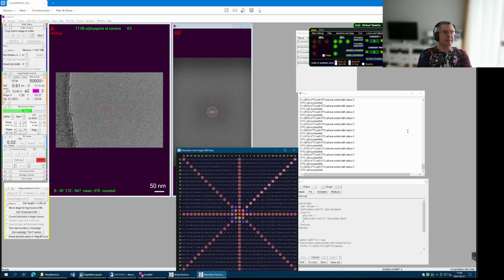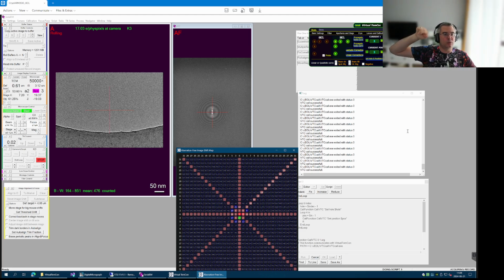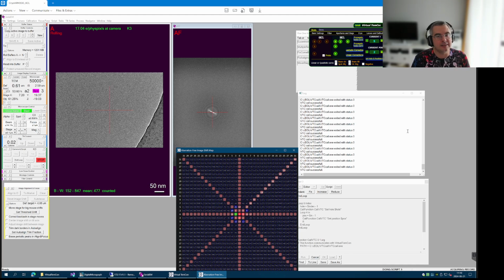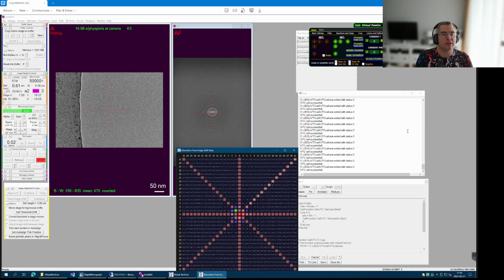So once you get the OL stig and coma corrected for the most distant holes, so holes X and Y, you can then set positions in the central hole, and these positions are really just image shift. And because Virtual TemCon already knows how much corrections are required for coma and OL stig, it's able to apply them for these small shifts within a hole as well. So you don't have to calibrate these separately for each position. This is no longer required.